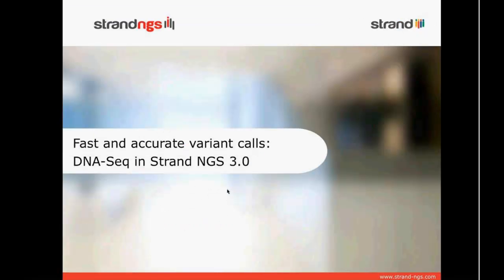I'm going to devote the rest of this webinar to how we actually achieved fast and accurate variant calling in Strand NGS. I'm going to give you a bird's eye view of DNA-Seq in Strand NGS. I'm also going to give you some sense of how we actually benchmarked DNA-Seq in Strand NGS 3.0.